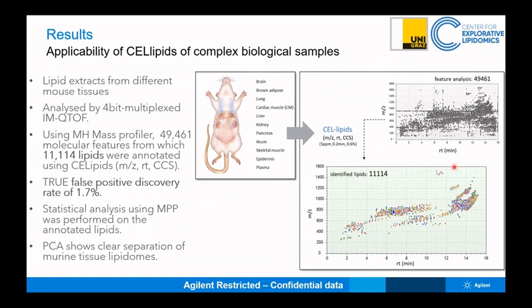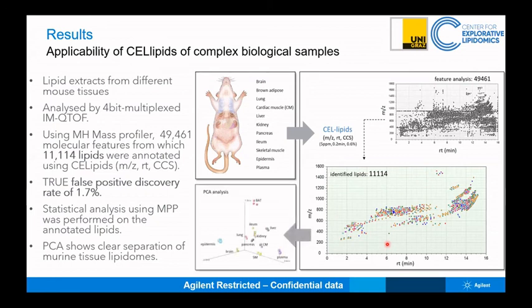I would say once you have your library or this work done, then it becomes easier to do. The PCA analysis is just to show you the different tissues that were used. Some of them were brain tissues, epidermis, lung, liver, etc.